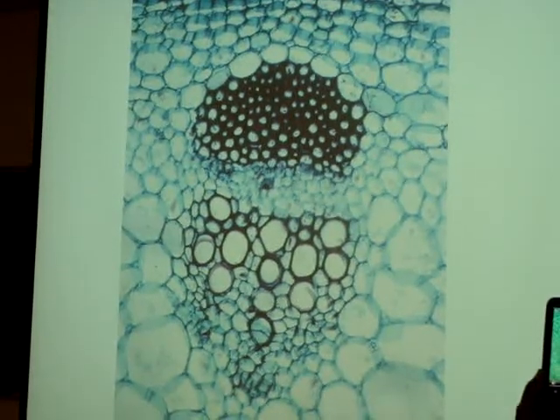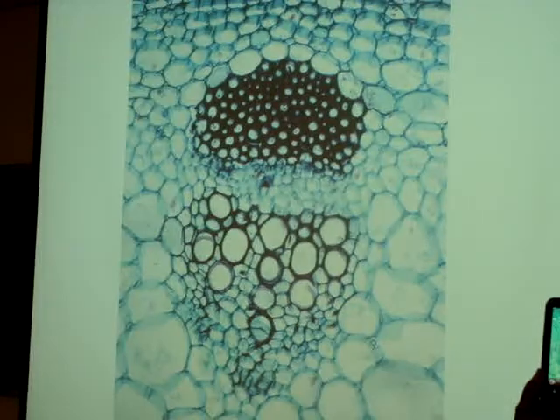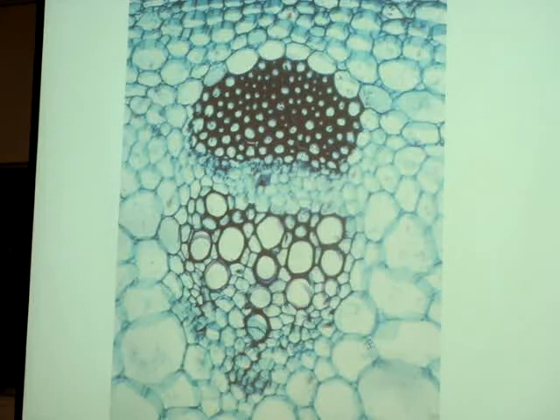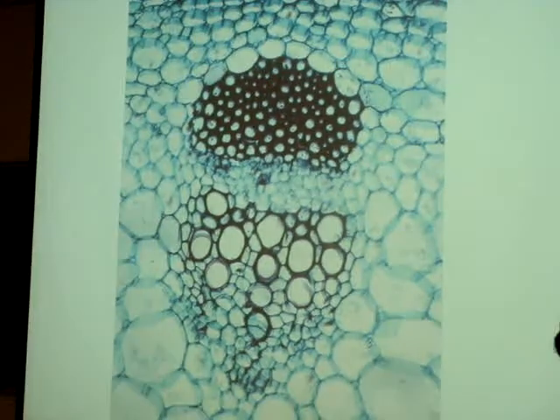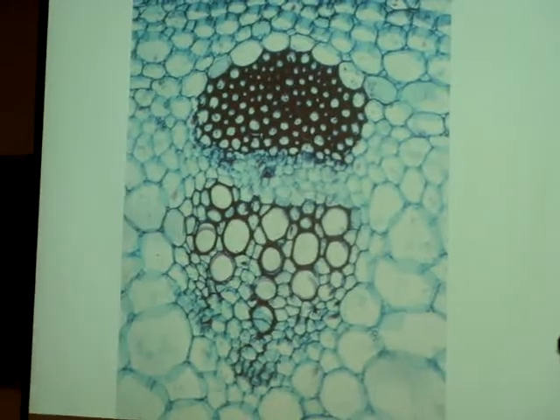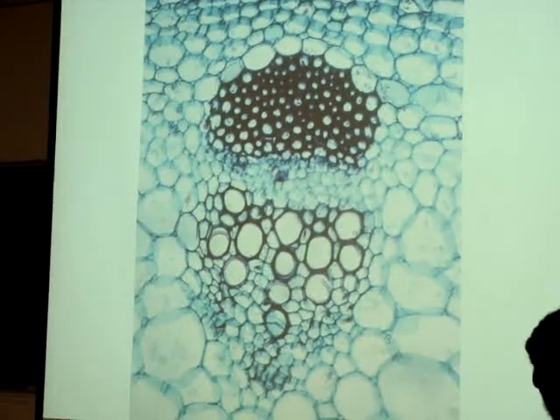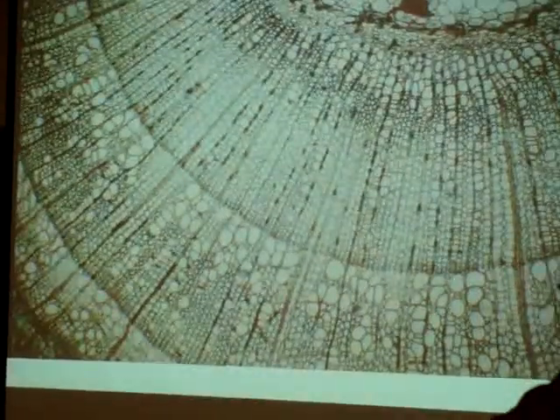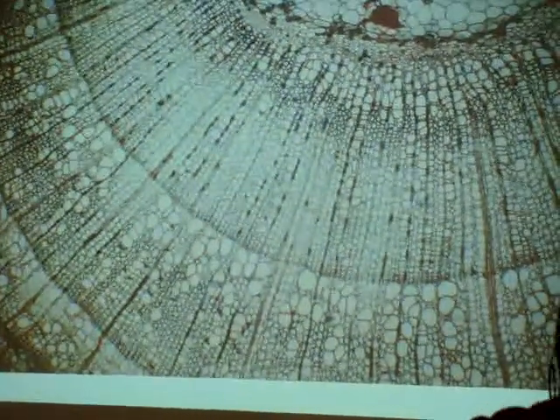Nice and washed out, but this is actually like a black and white. Xylem, sclerenchyma, with phloem kind of sandwiched in between. Yes, no, maybe? Maybe.